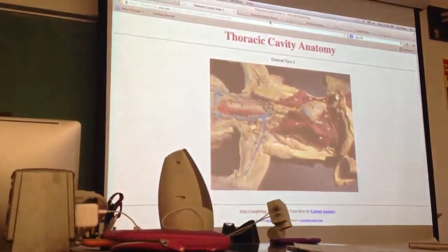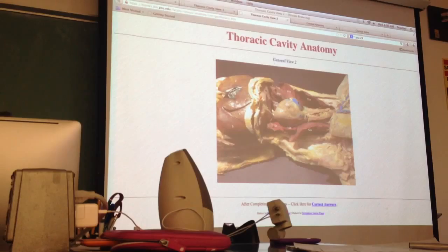Parietal pericardium. Now I'm going to switch views again. The cat actually flips directions. So if I'm just reading it, here's the diaphragm, the abdominal cavity, the head would be over here. So right here where it has that 9 and this little membrane chunk right here, that's the pericardial, or the parietal pericardium removed. And then here we just have the surface of the heart showing.